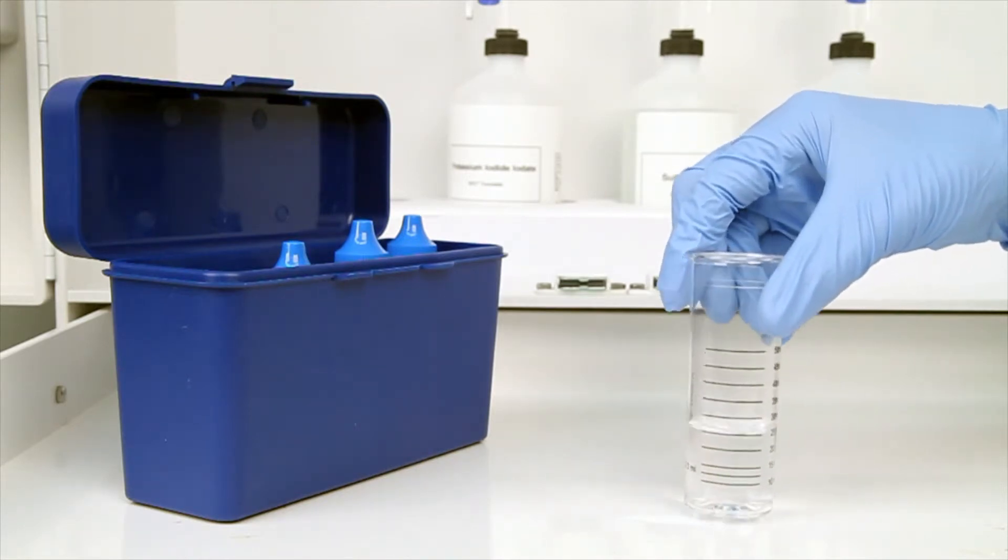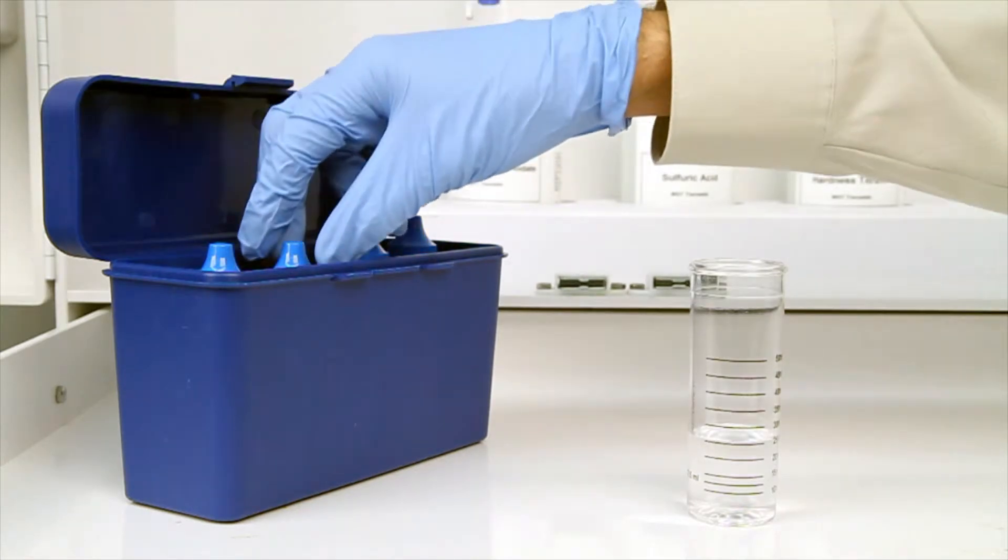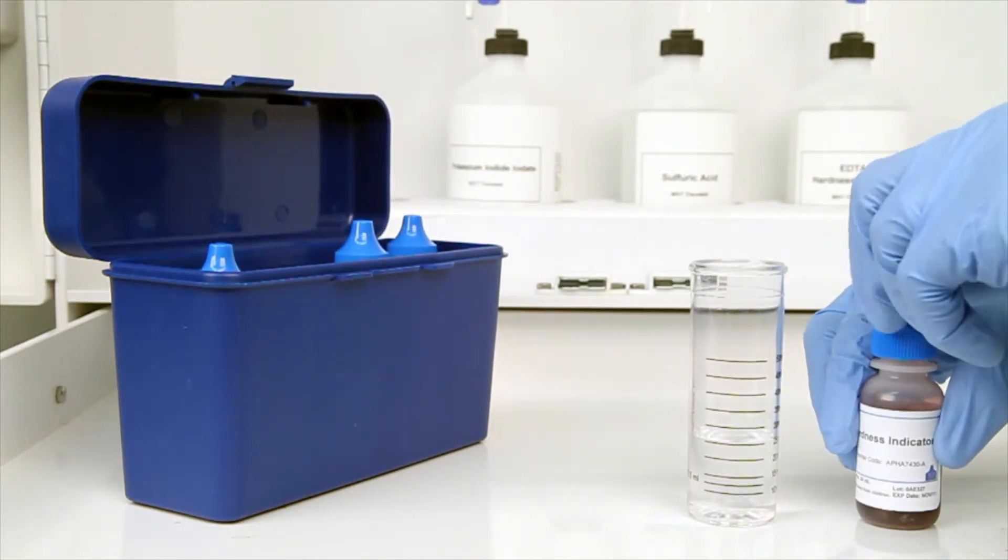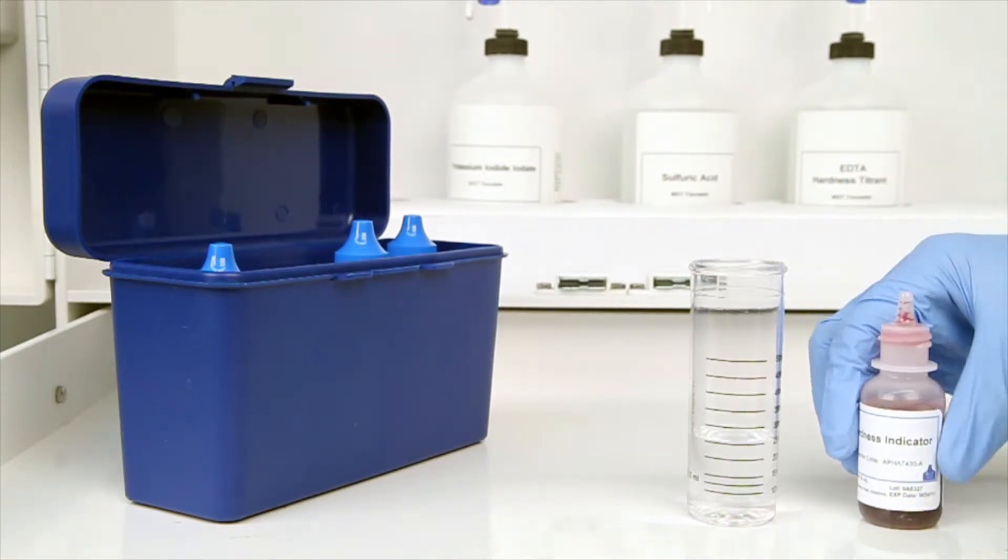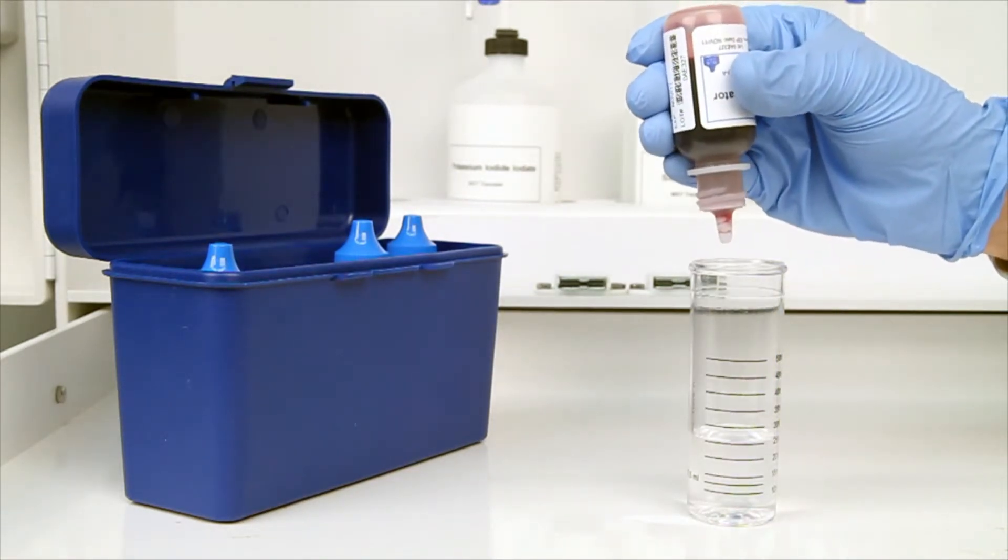The next step according to the Endpoint ID procedure is to add five drops of hardness indicator. Be sure to hold the bottle vertically to get a consistent drop size. Remember to swirl the vial after the addition of each reagent.